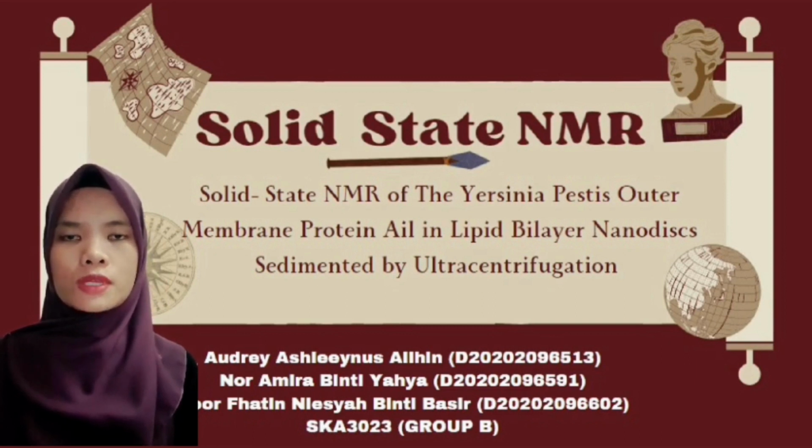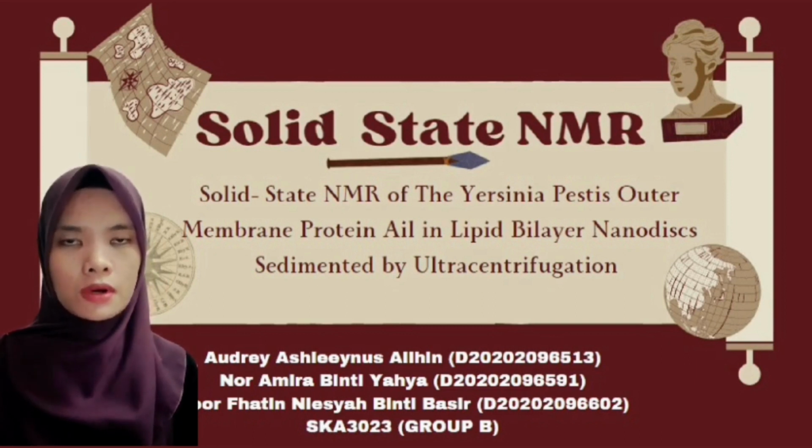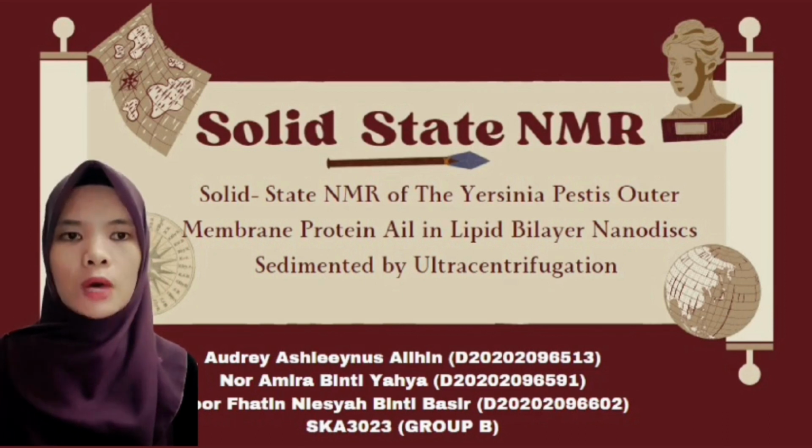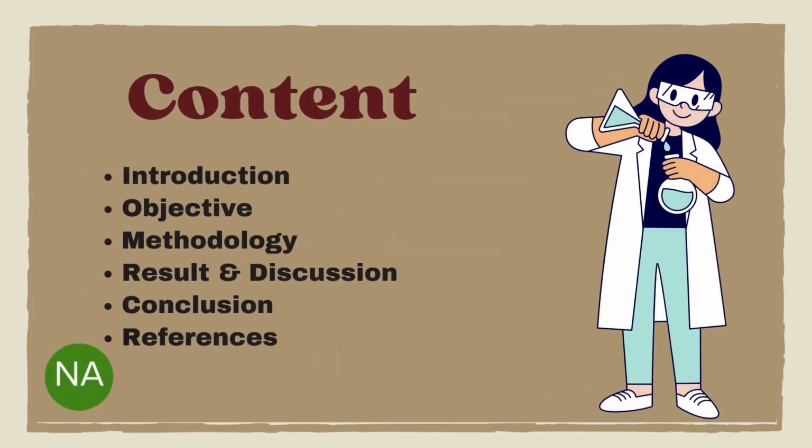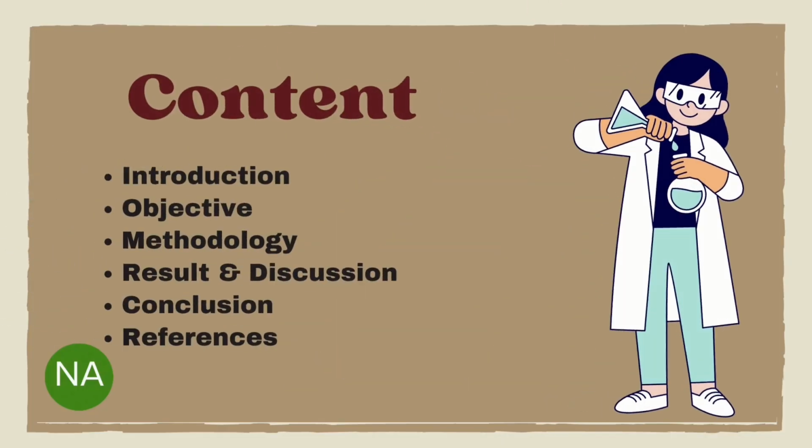Today we would like to present our findings about solid state NMR, and the title is Solid State NMR of the Yersinia pestis outer membrane protein Ail in lipid bilayer nanodiscs sedimented by ultracentrifugation. So these are the list of contents for this presentation.